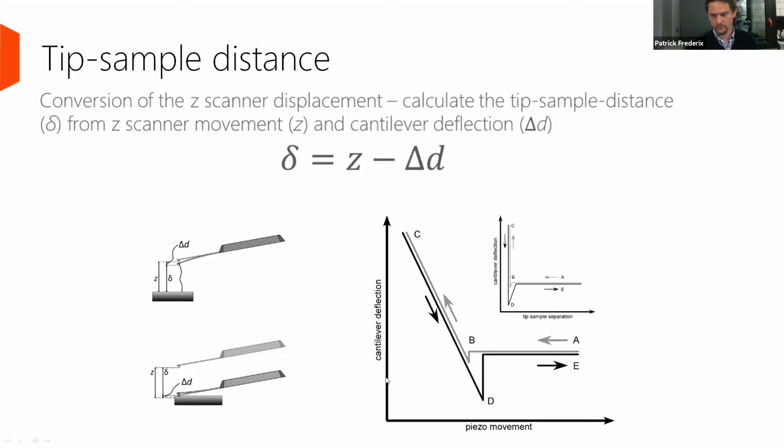If you do that and you look at the force curves, you can immediately see if a curve has been adjusted or not. On a hard surface, in the contact phase, the curve gets vertical, and particularly at the snap out, you will see that normally the deflection goes in one step from a high deflection to 0. But in this phase, if you look at the tip sample distance, the tip suddenly makes a jump to a larger distance away from the surface, and you get this angled line.